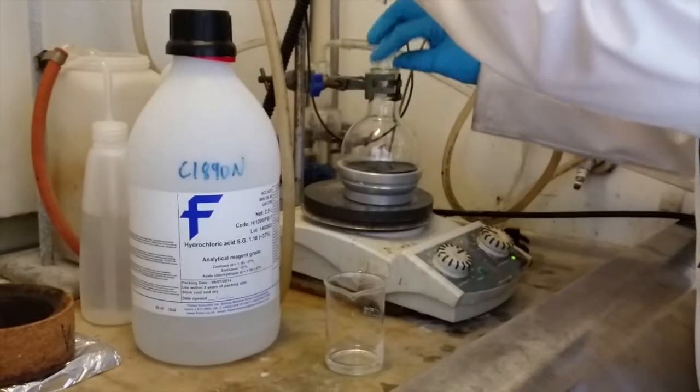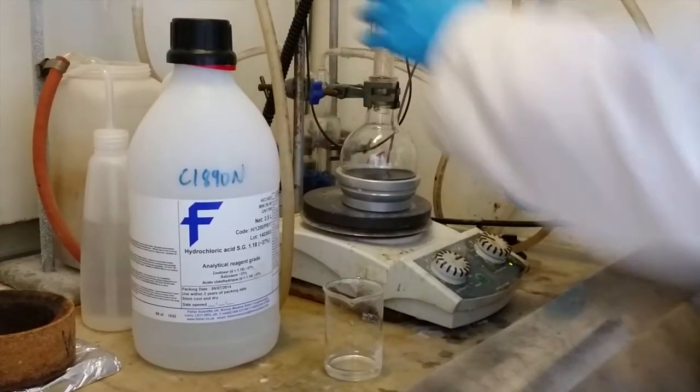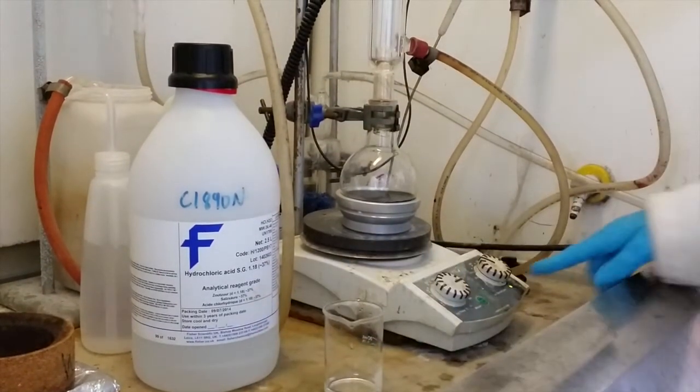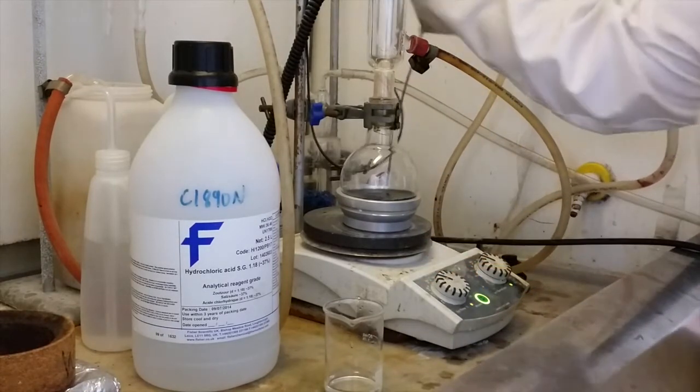Finally add the tin 2-chloride dihydrate to the reaction mixture and set the reaction mixture heating to 60 degrees. Ensure that the water is turned on on the condenser.